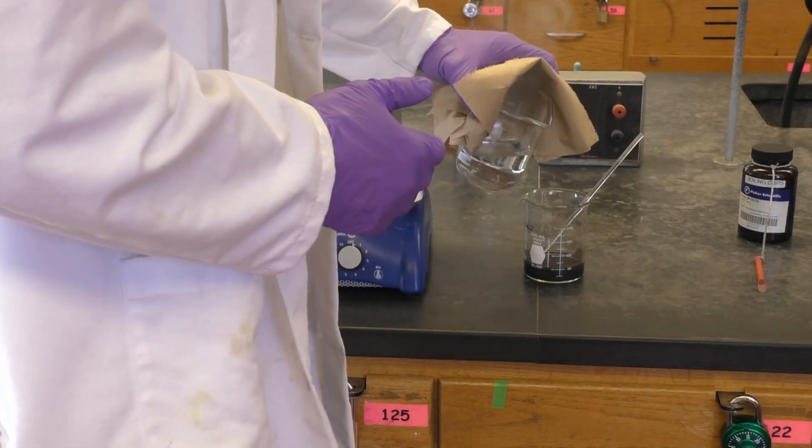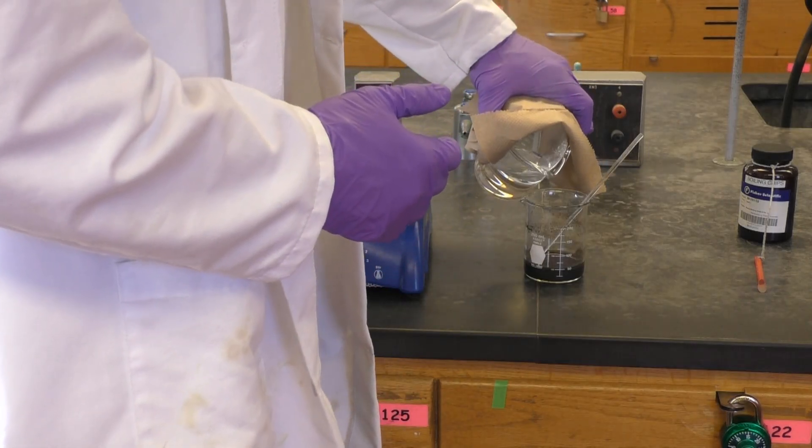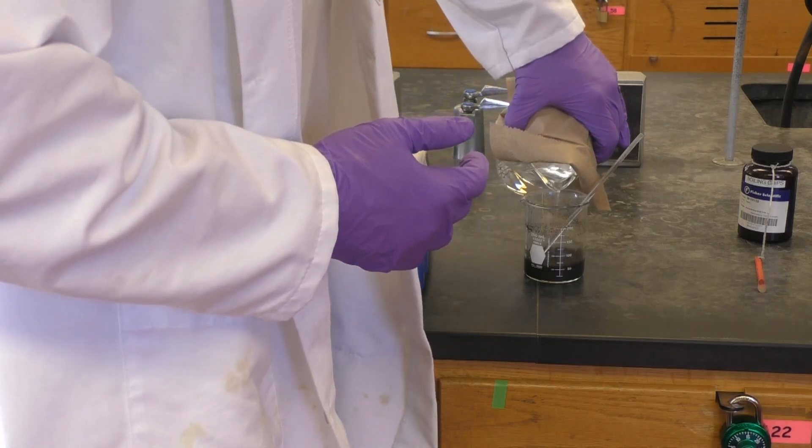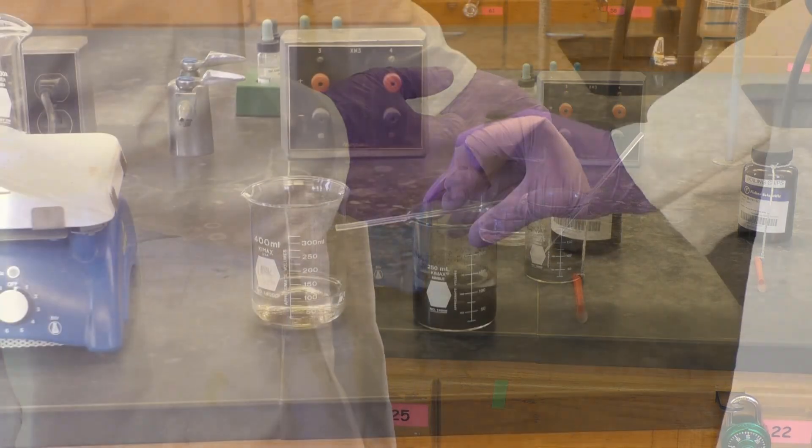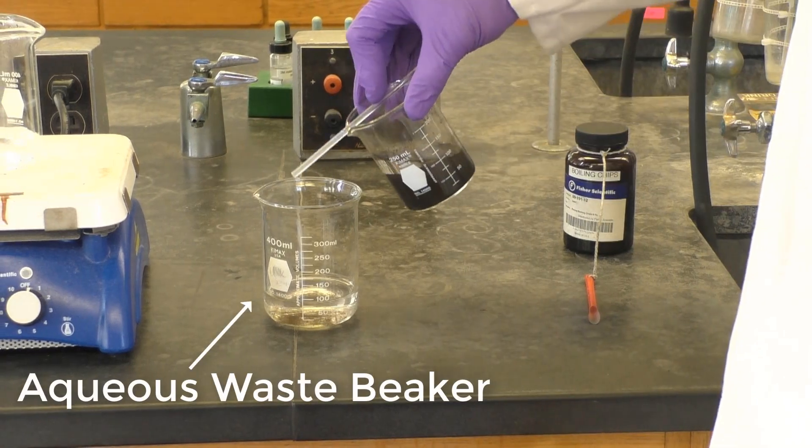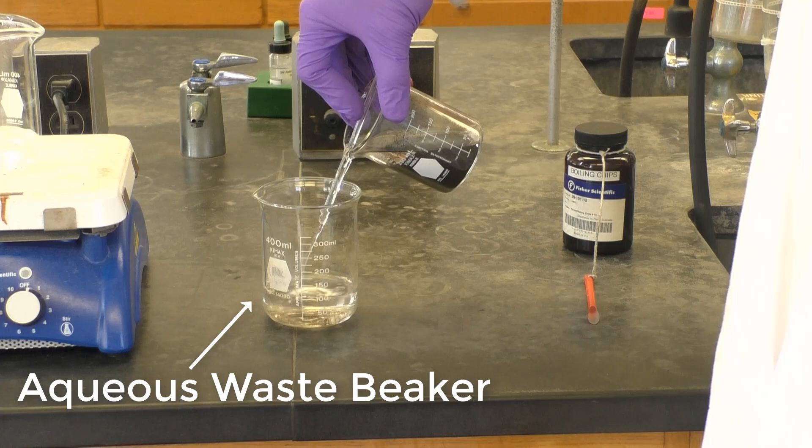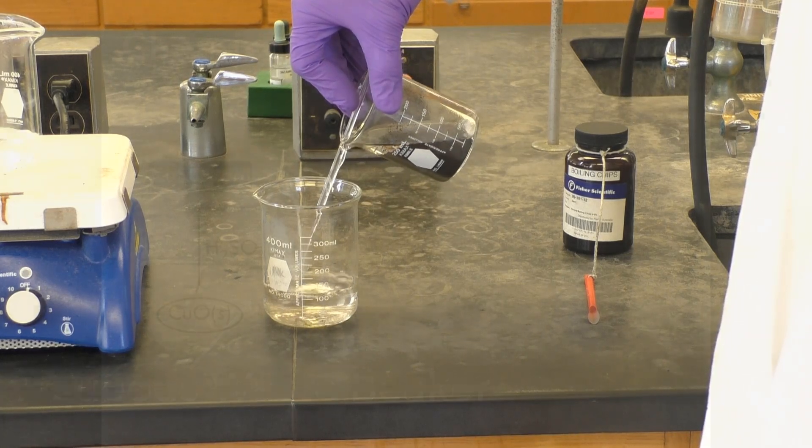We now want to make sure all of these undesired compounds are separated from our product, so use the water you heated earlier to rinse your copper-2-oxide. Just add the hot water to your flask, stir, allow the black solid to settle, and decant. Repeat this rinsing once more to really make sure all you have in your flask is clean copper-2-oxide.